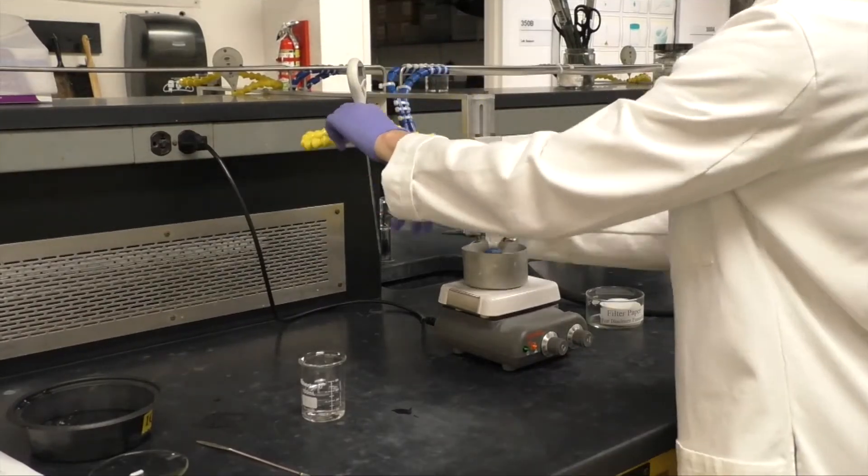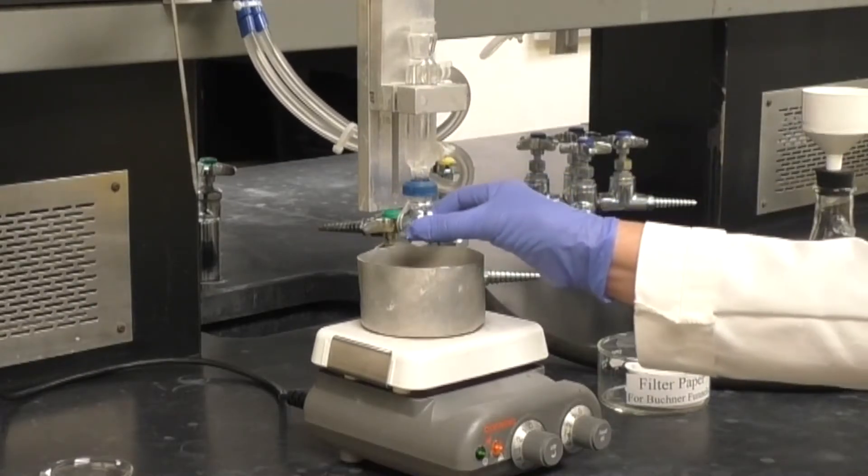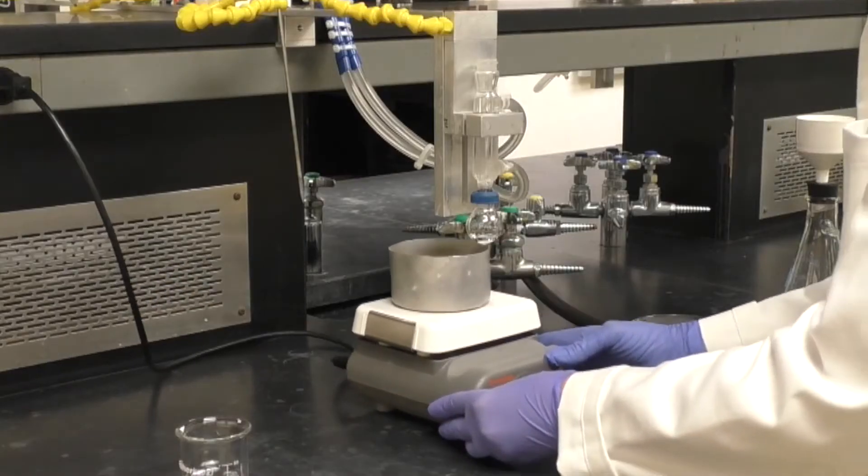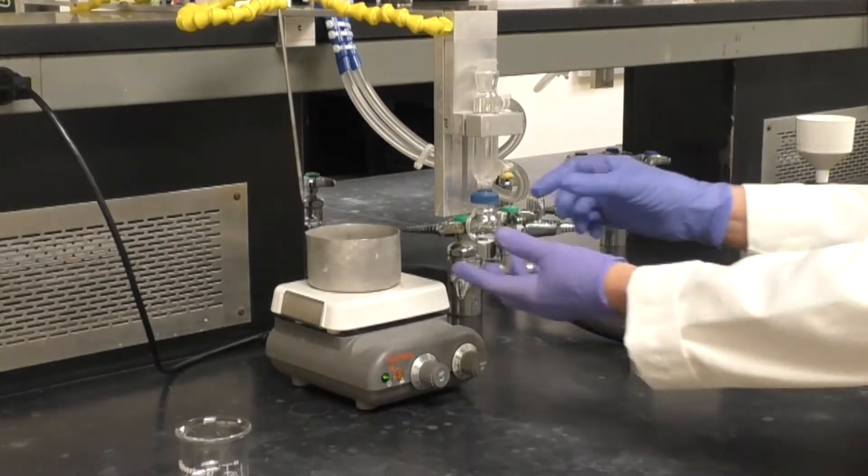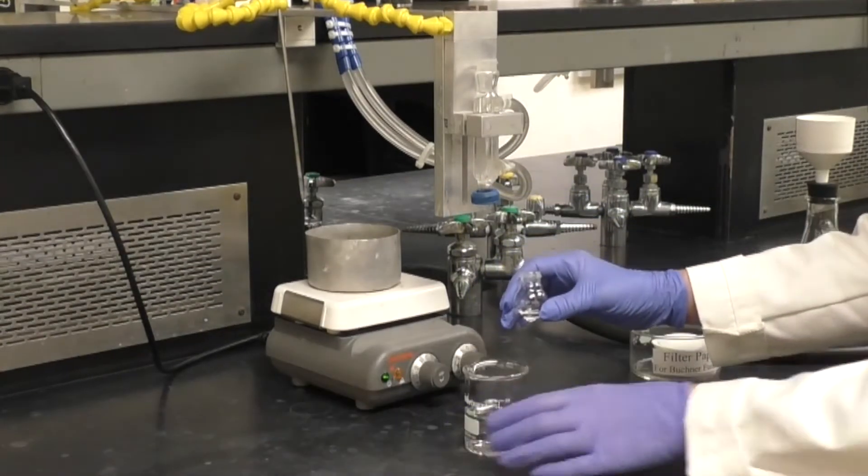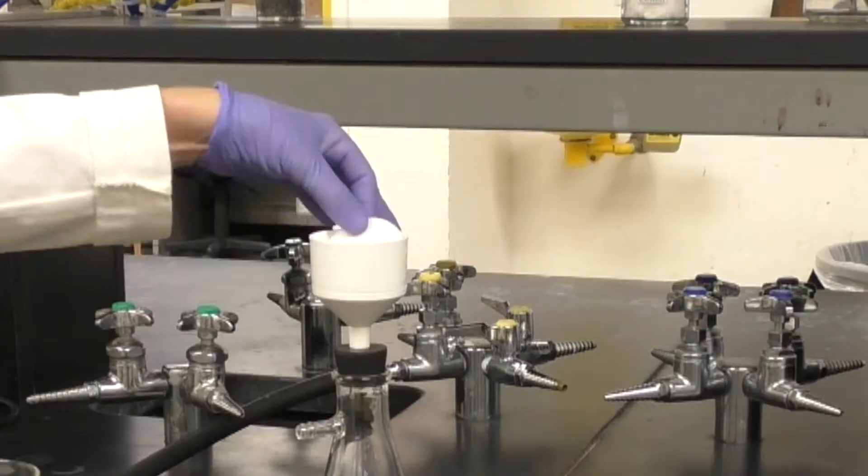After 20 minutes, pour your reaction into the 50 milliliters of water. Note that the round bottom flask will only be warm to the touch due to the low temperature of the water bath. As you pour your reaction mixture into the water, a precipitate will form. This is your anhydride product.